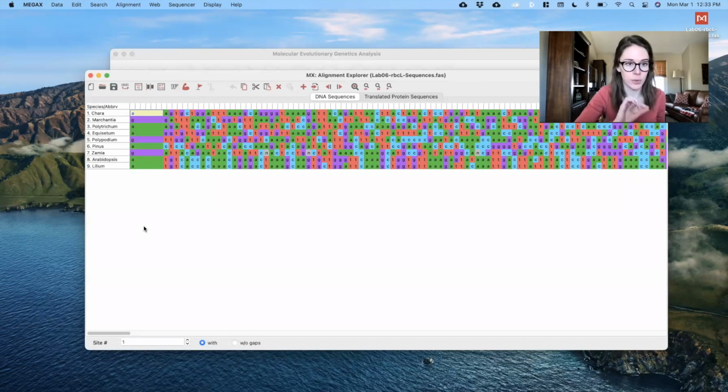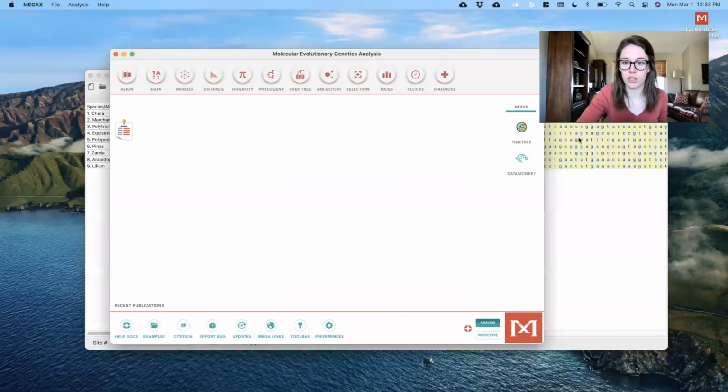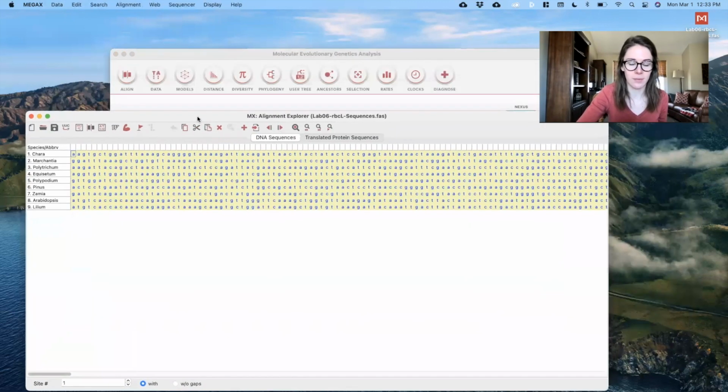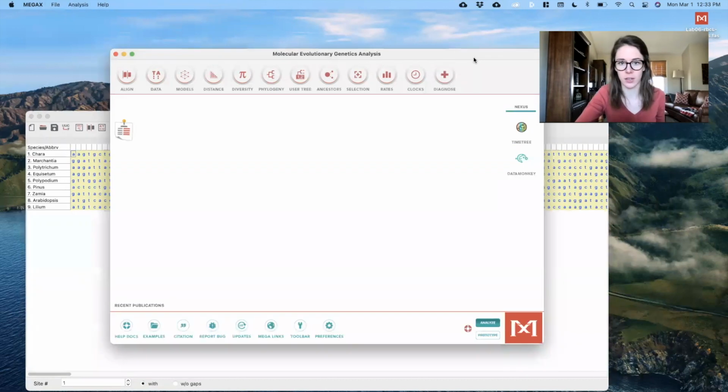So this is the first weird glitch. As soon as I click on this other window back here, it is going to magically highlight all of my data on that other one. So I hit Command A, then you just have to click on this other window. It's doing it, it's just for some reason not showing it being done until you click on that other window. I don't know, it's a little odd.